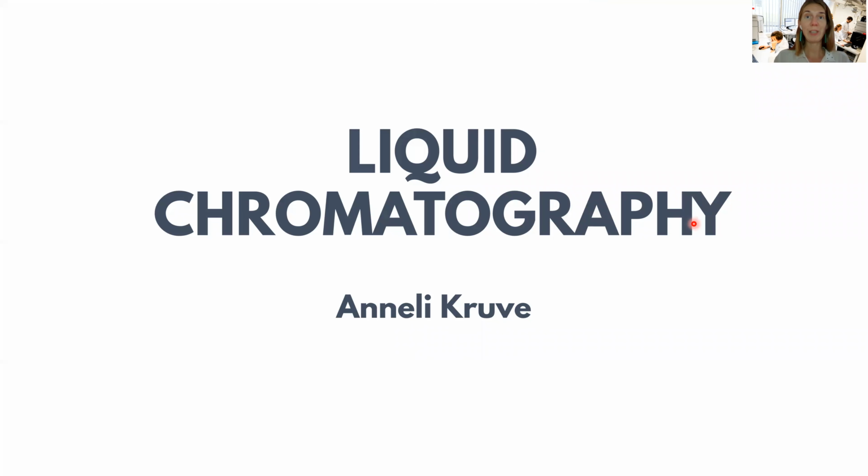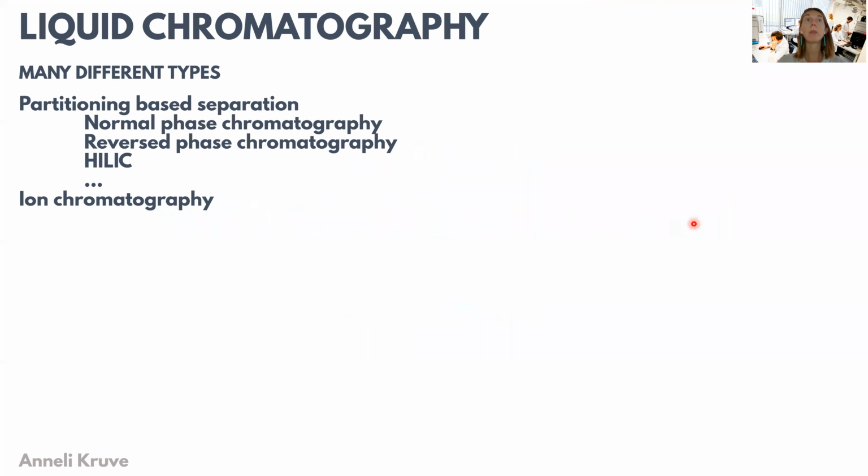Welcome to the next lectures about liquid chromatography. In a few upcoming videos, we are going to dig into liquid chromatography in particular and look at a few different types of it, as well as have a look at the instrumentation of liquid chromatography. So first of all, liquid chromatography has multiple subtypes. There broadly are two types based on different interactions.